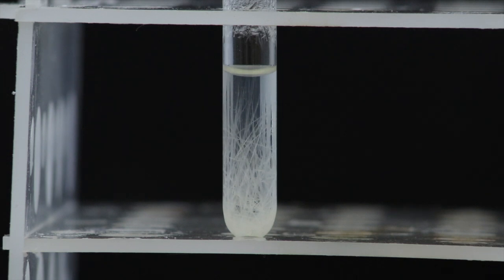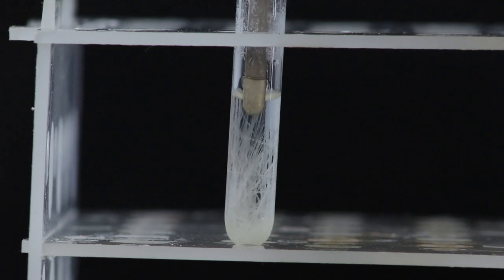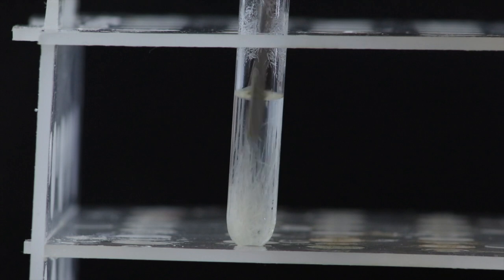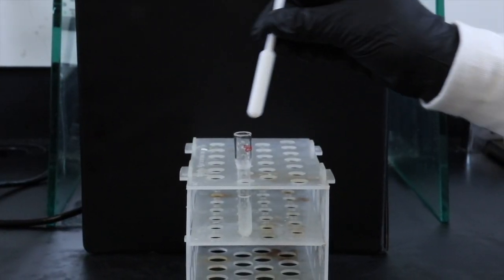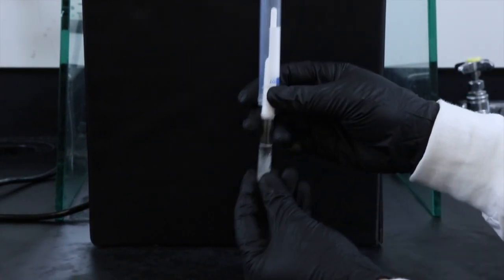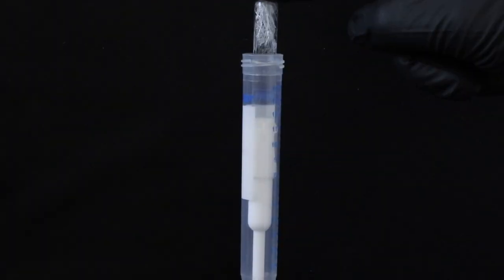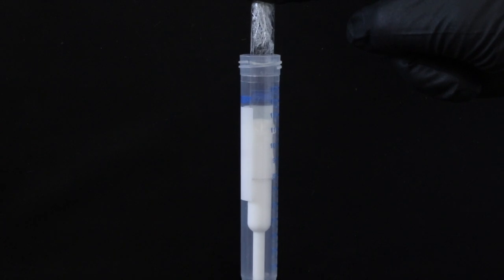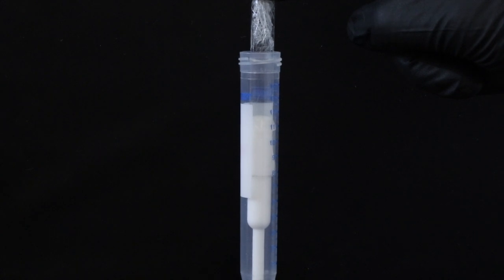Once the recrystallization process is done, I'll just scrape the sides with a spatula so it'll be easier to remove the crystals and they don't stick to the sides as much. To remove the crystals from the solvent, I'll place this stopper in the top of the Craig tube, and then I'll place both of them inside of a polypropylene test tube, flip it upside down, and then put it into a centrifuge. What that will do is pull all of the liquid to the bottom of the test tube, but the stopper will keep the crystals inside the Craig tube and therefore removing them from any liquid.